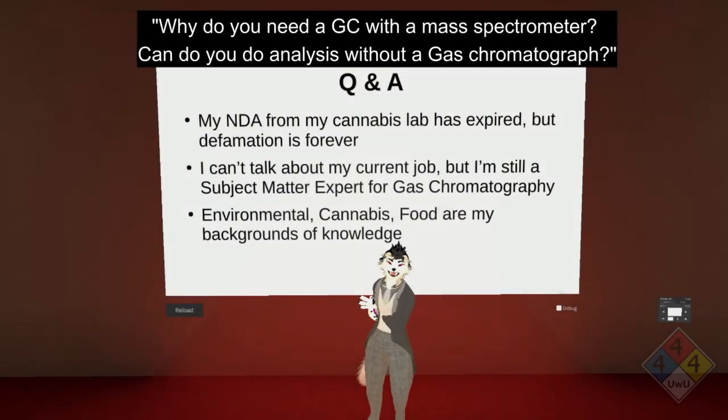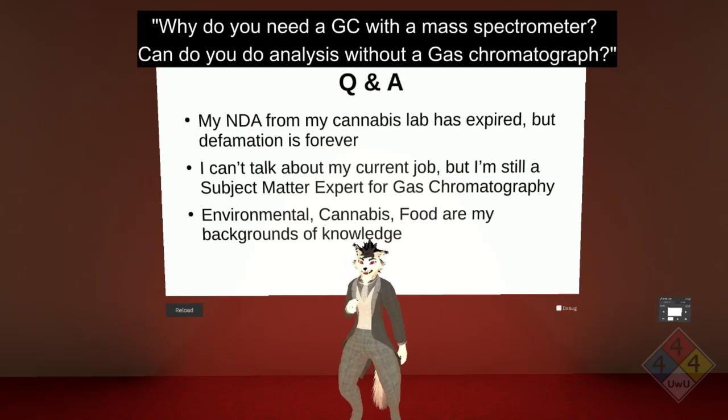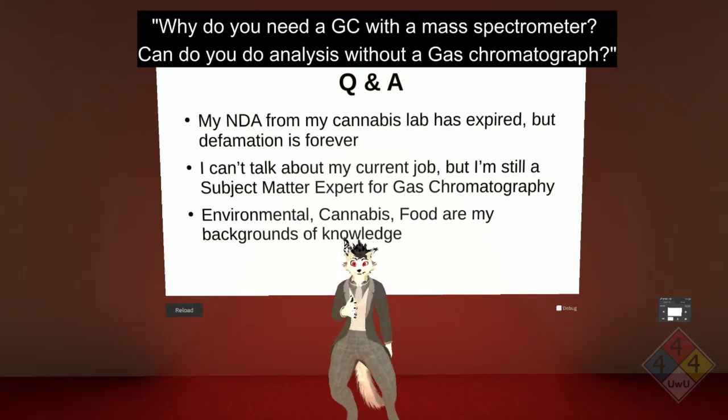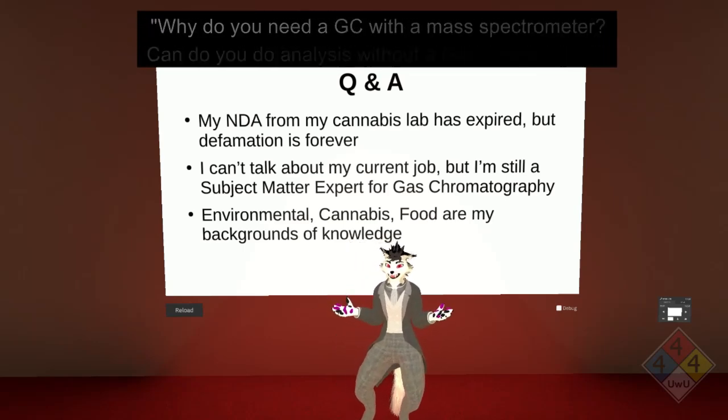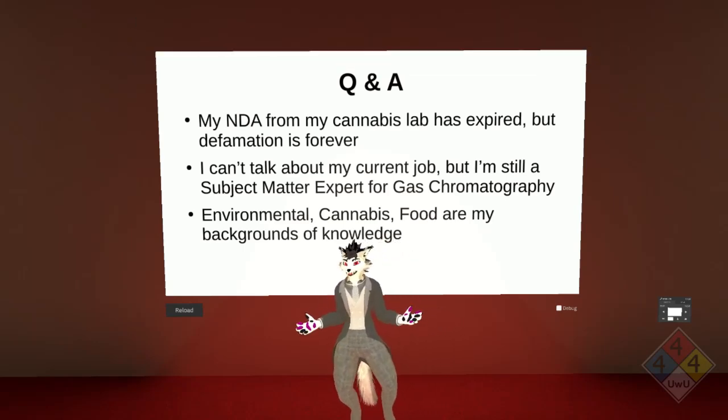I'm actually dealing with that right now. The technical answer is yes. You know, sure. I wouldn't recommend it, because you're like, okay, what are you injecting then? Are you injecting something that's so pure that there's only one thing? Because if it's more than one thing, it's all going to hit the detector at once.